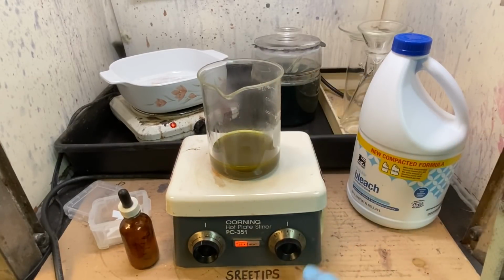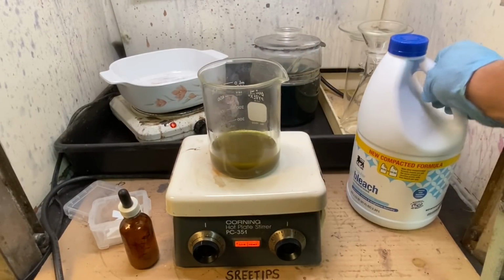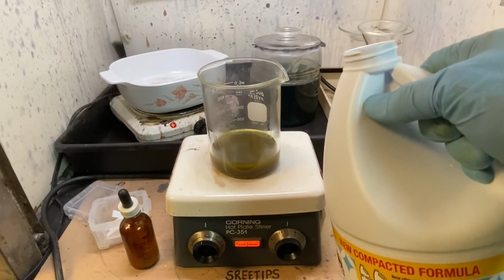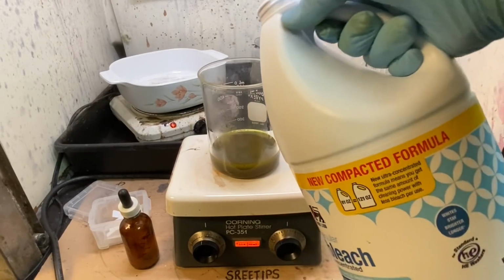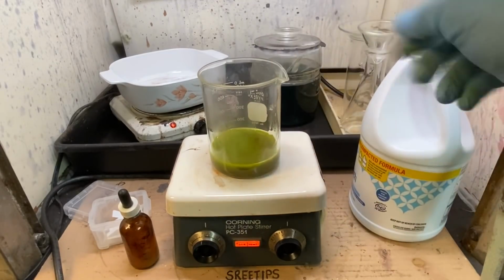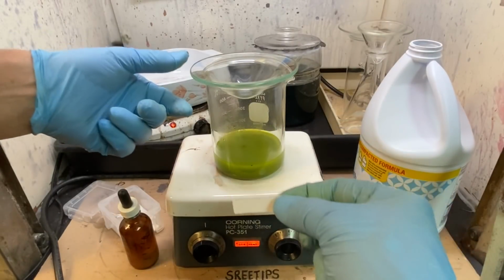Turn some heat on. Get our solution heating up. And now I'm going to add some bleach. Just regular old household bleach that you get from the grocery store. 6% sodium hypochlorite. Add a splash in, see what happens here. I just added a splash of bleach.